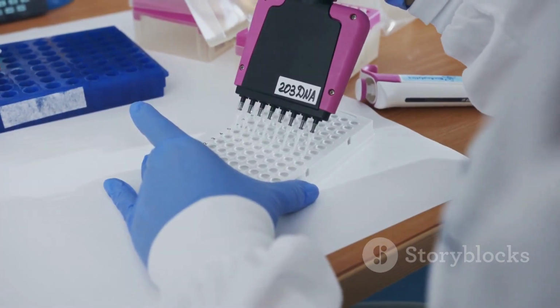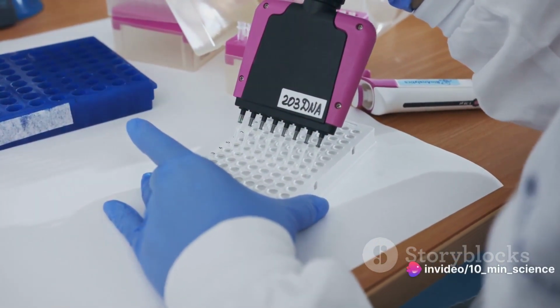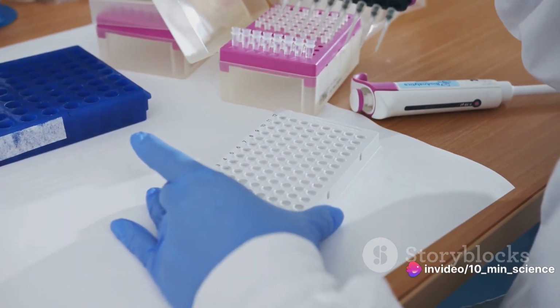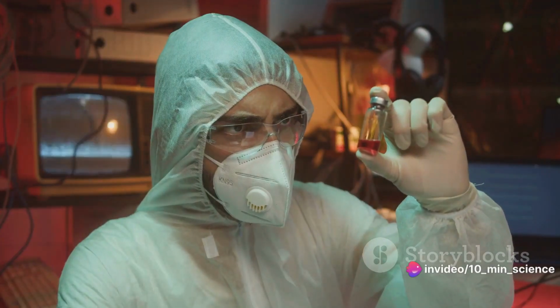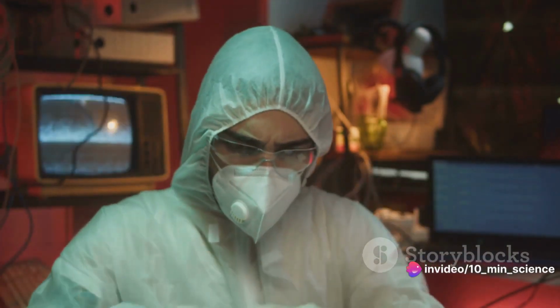But why do we use an internal standard? Well, the purpose of an internal standard is to improve the precision of results. By using a known quantity of an internal standard, we can minimize the impact of experimental variables. It's like having a reliable compass in the ever-changing sea of chemical analysis. Now, how does an internal standard enhance the precision of HPLC?